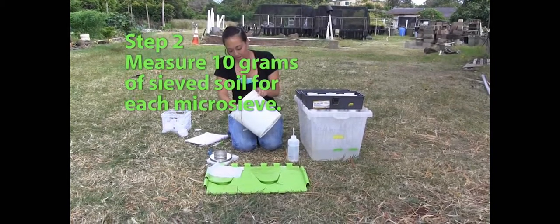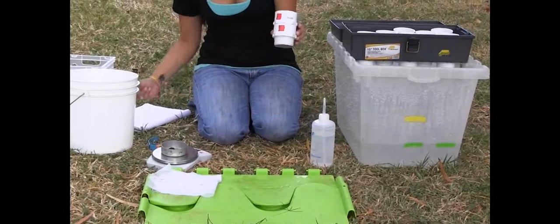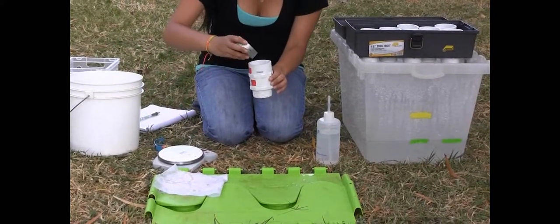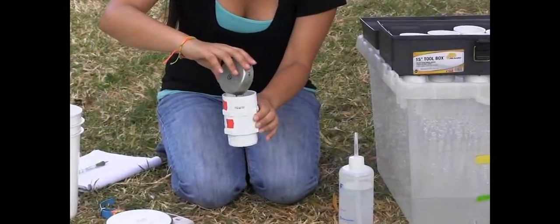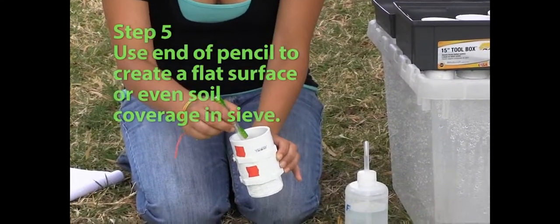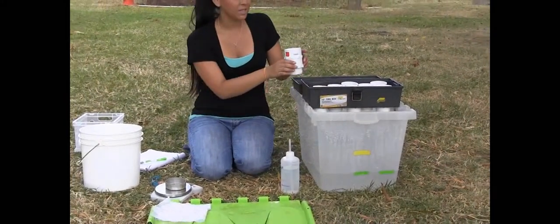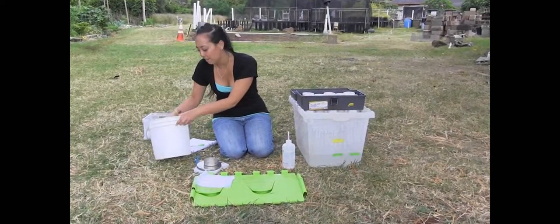Weigh out about 10 grams of soil. Once you weigh it out, you're going to take out your sieve and make sure you record the weight of the soil with the correct sieve that you're putting the soil in. When you're pouring the soil into the sieve, make sure not to leave any of it behind as that'll throw off your calculations later. Then use the tip of your pencil and make the soil into an even surface within the sieve. If any soil falls through the bottom sieve that's okay, because that soil is going to be lost during the testing anyway. Then we're going to do the same thing for all eight of our sieves.